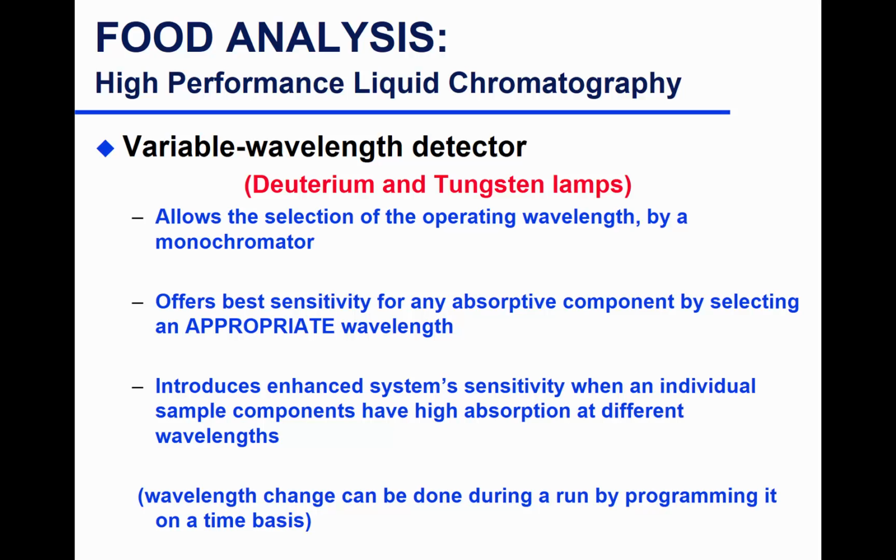So what happens here, all your light is split into individual wavelengths, and then you have a filter, or not necessarily a filter, an opening, where a particular wavelength enters, 3 or 4, let's say. It's a very narrow opening that allows mostly one wavelength or very, very closely related wavelengths to each other. Probably 304 and 303 might be able to enter, and then hit your flow cell.